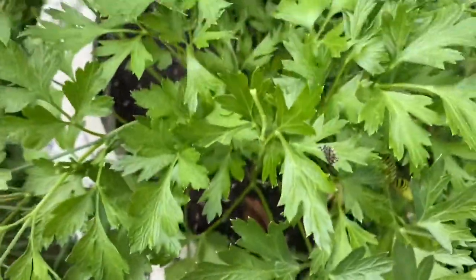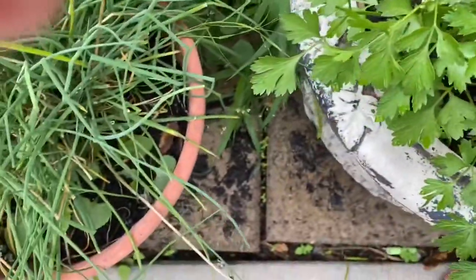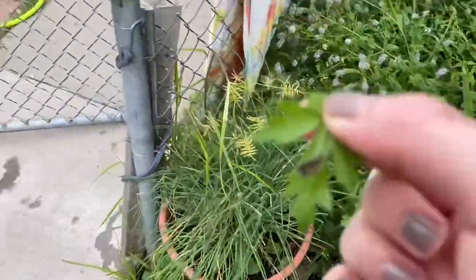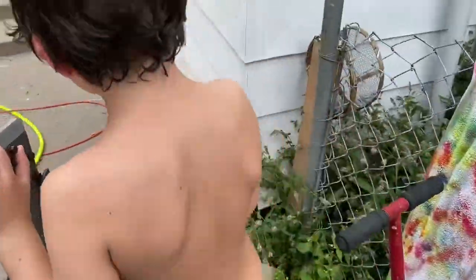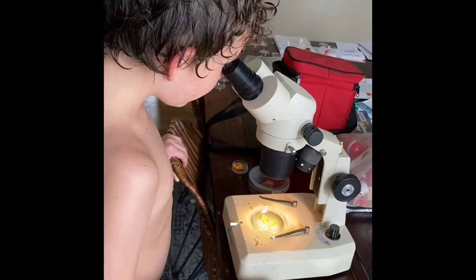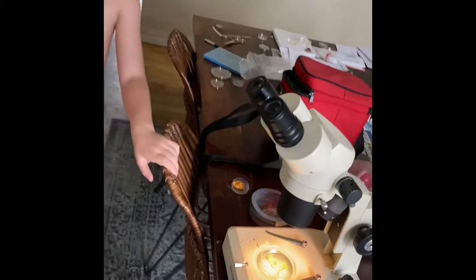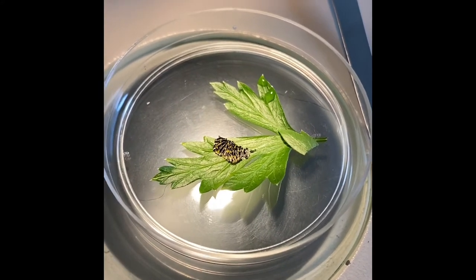This is really interesting — Ben, we gotta do this under the stereo microscope. Look at that, it's either a dead caterpillar or it molted its skin. It looks like molted skin — let's take this whole leaf and put it under the stereo microscope. It's really easy to see under this sweet microscope. This thing we found on the leaf definitely seems to be a molted caterpillar skin. You can see its little feet and everything. That is like a molted skin of a caterpillar — you can see its little feet. You can kind of tell it's caterpillar skin, including its little feet.